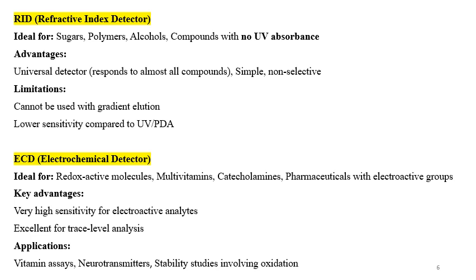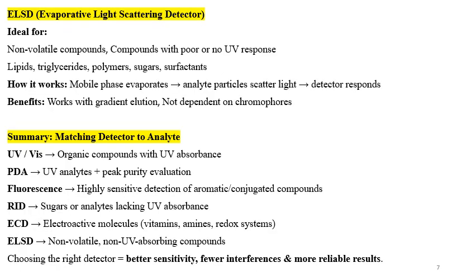Then the ECD detector, electrochemical detector, ideal for redox active biomolecules or molecules, multivitamins, catecholamines, pharmaceuticals with electroactive groups. Advantages are very high sensitivity for electroactive analytes, excellent for trace level analysis, and applications for vitamin assays, neurotransmitters, stability studies involving oxidation type of reactions.